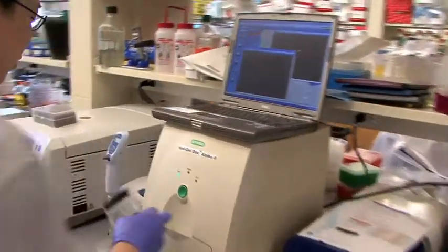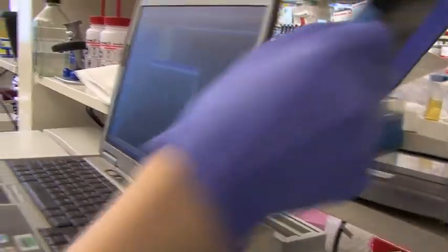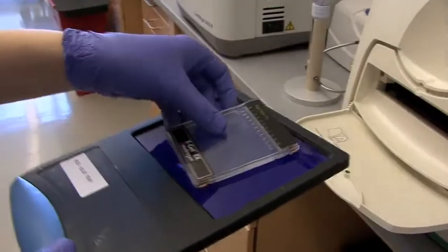When we had the opportunity to try the EZ system, what ended up happening was basically everyone switched over to it, mostly because it was very fast and easy to use.